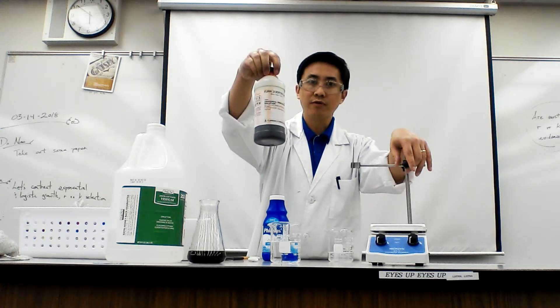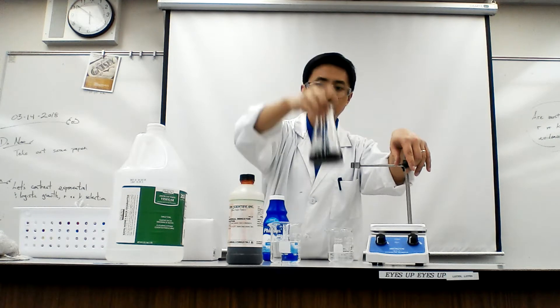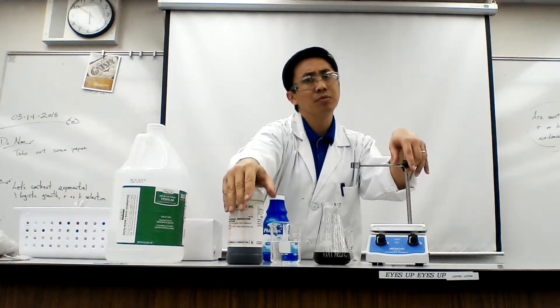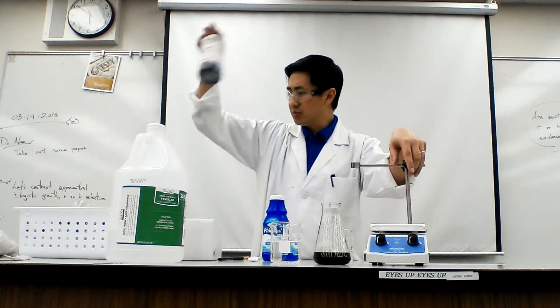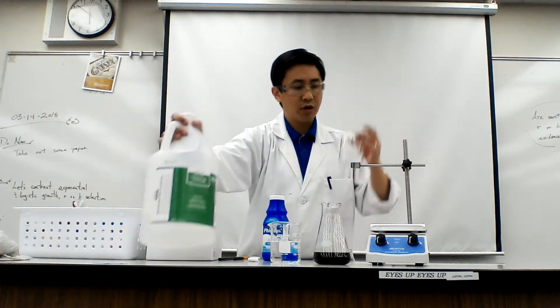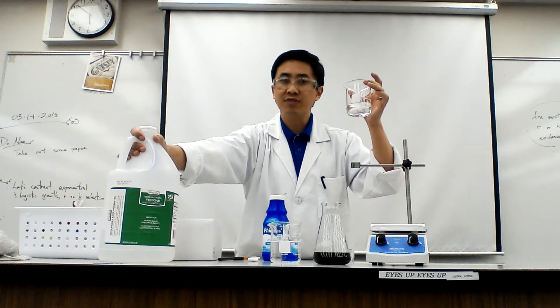We're going to be using universal indicator. Notice that I put it into this beaker so we don't need to touch the stock — I just have the bottle out, but don't pull from the stock. We want to keep the stock nice and clean. And then some vinegar.